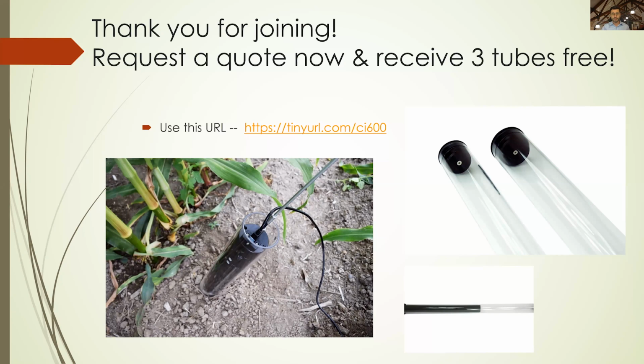Let's see. The next question is, is there a miniature version available? Currently, sad to say, there is not, but that's something we can definitely keep in mind as we continuously progress the advancements of this technology.